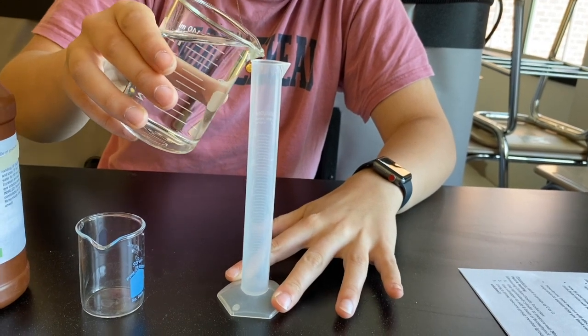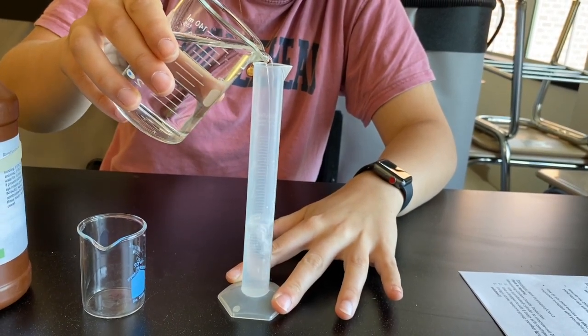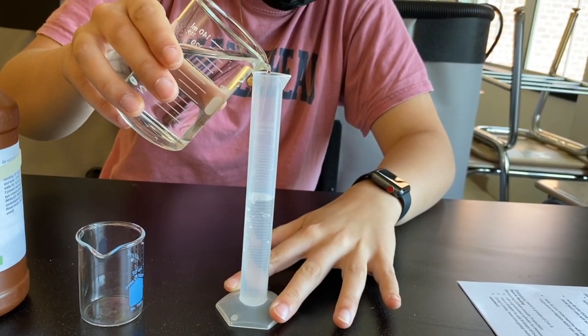Use a graduated cylinder to measure out 20 milliliters of tap water and pour it into a small beaker or a cup.